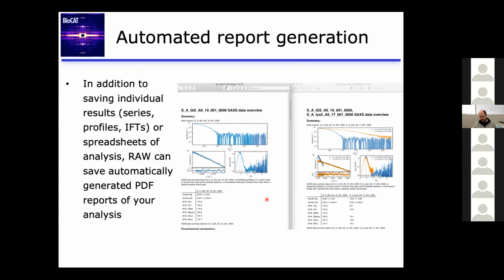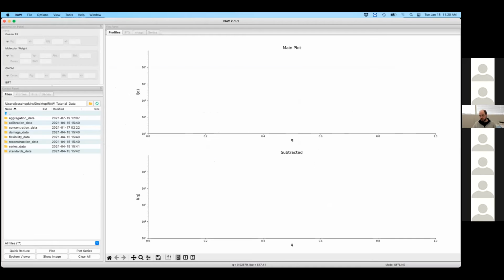So I know this is running through things very quickly. The goal here, of course, is just to provide you with an overview. If you really want to learn how to use the program, we have extensive documentation and tutorial videos, as I mentioned. But what I'd like to do now is shift gears a little bit from just showing you slides to actually doing a quick demo of all this functionality.